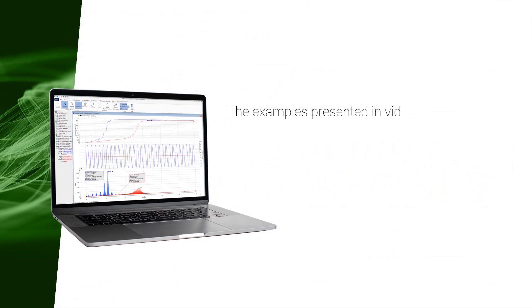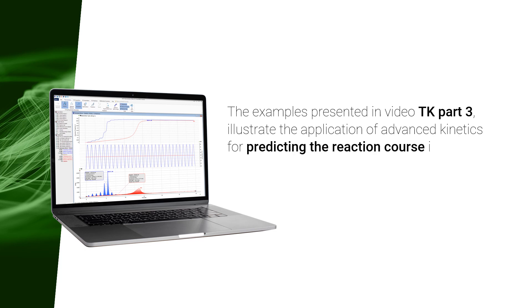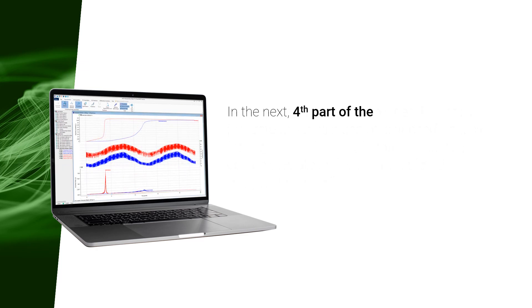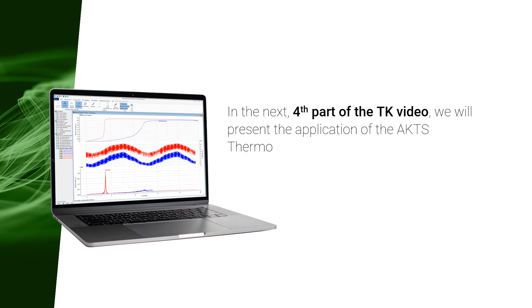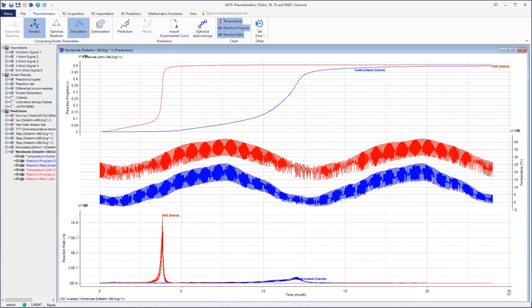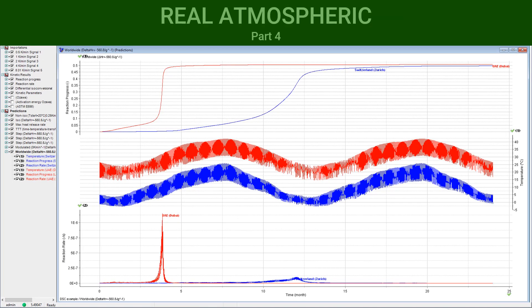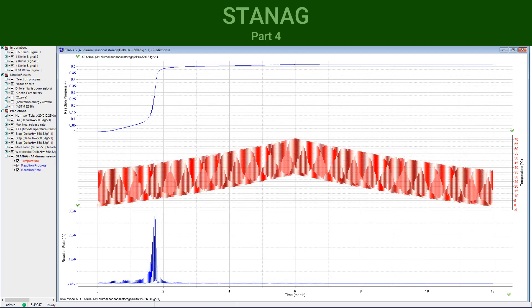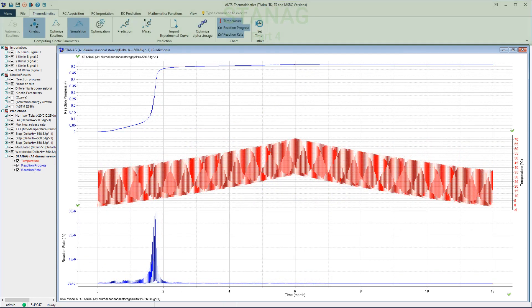The examples presented in Video TK Part 3 illustrate the application of advanced kinetics for predicting the reaction course in user-customized stepwise and modulated temperature conditions. In the next, fourth part of the TK video, we will present the application of the AKTS Thermokinetics software for the prediction of the reaction course under temperature profiles that the user does not set, such as: prediction of the reaction course at real atmospheric temperature fluctuations, prediction of the reaction course in climatic zones specified by STANAG, and prediction of the reaction course at temperature fluctuations recorded by data loggers.